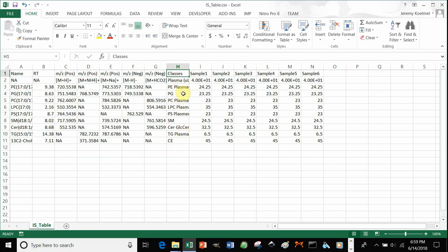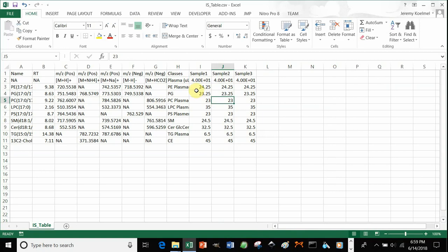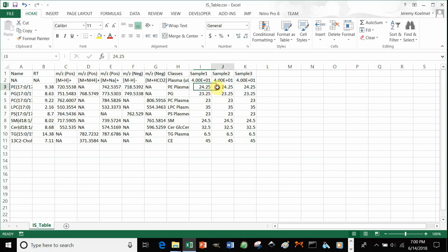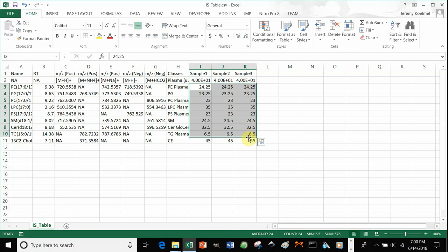After you have decided which classes could be normalized using which internal standards, you can type in all of your samples. In this case, let's say we only have three samples — you would only put three samples in. For each sample, you should put the exact quantity of internal standards spiked in. Note that if you wanted to normalize by weight or protein, you could do that here — for example, if we had 24.25 micrograms of lipid spiked in, you could divide that by however much protein, giving you micrograms per protein, which would then be used to normalize your features.